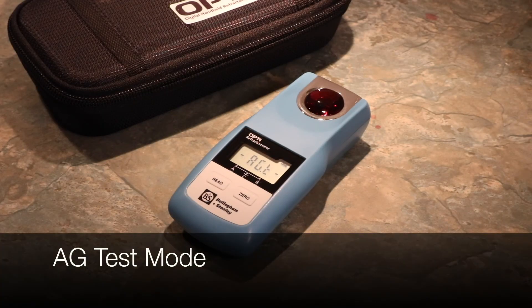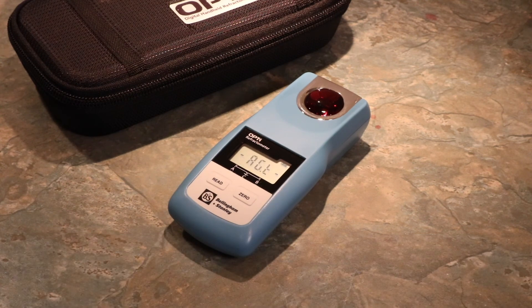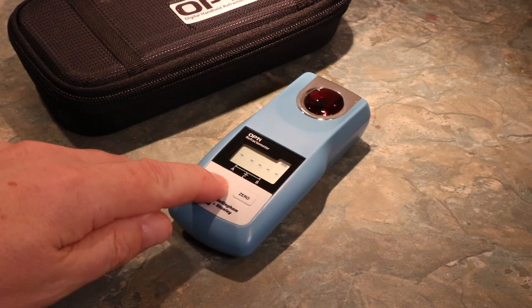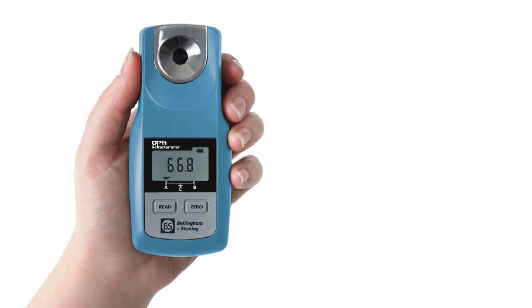To calibrate or check the calibration of the Opti with AG test mode, enter the Special Features menu. Select AG test mode by pressing Read. Press the Read button and a countdown will begin. Our example shows that the AG test mode is valid with a Brix reading that is temperature corrected in accordance with the AG fluid. This can be verified against the bottle of fluid used to make sure that the instrument is operating within its limits. AG calibration fluids can be purchased via your stockist or from www.refractometershop.com.